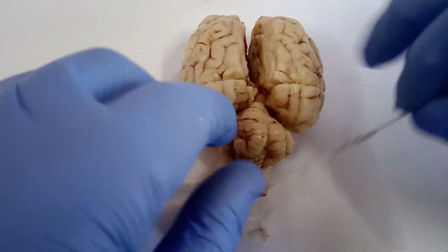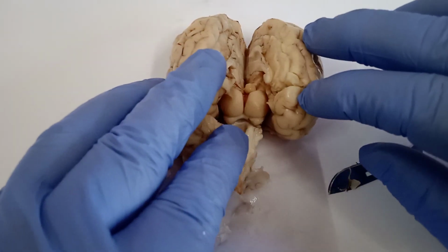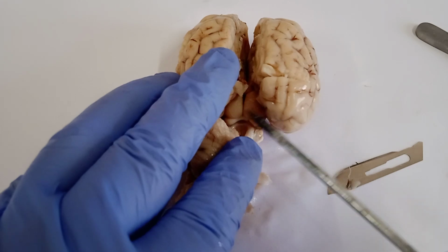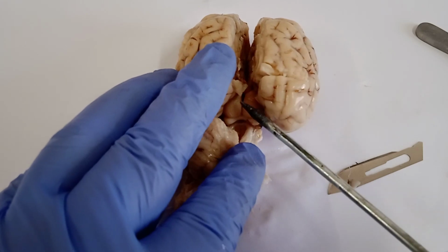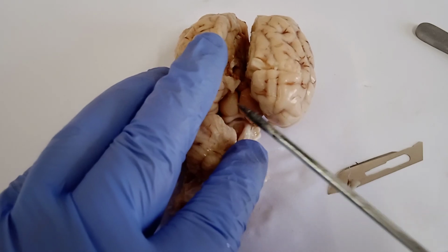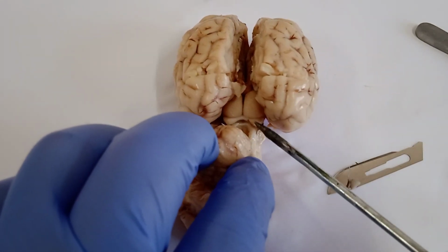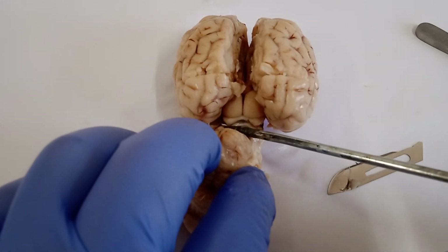So again, before cutting, because these things will be cut afterwards, just at this level you find these four rounded eminences, 1, 2, 3, and 4. Two big, and two small, these are called colliculi. Four colliculi together are called the corpora quadrigemina. So when you cut, two will come on this side, two on that side. The big ones are called superior colliculi, the smaller ones are called inferior colliculi. And if you look here, a small fiber-like thing is coming out.